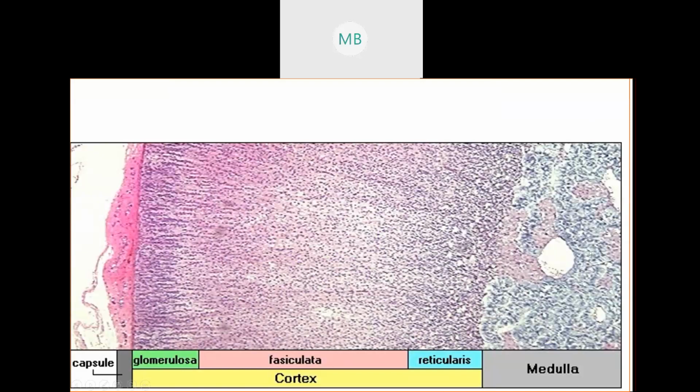And you have this middle medulla area that looks like it's stringier with more space between the cells. From the medulla comes epinephrine and norepinephrine. That's your fight or flight response. And then you have this cortex here. The cortex here has different layers. You have the zona glomerulosa here, which is where mineralocorticoid hormones such as aldosterone come from. So mineralocorticoids like aldosterone that help control your blood pressure come from the zona glomerulosa.